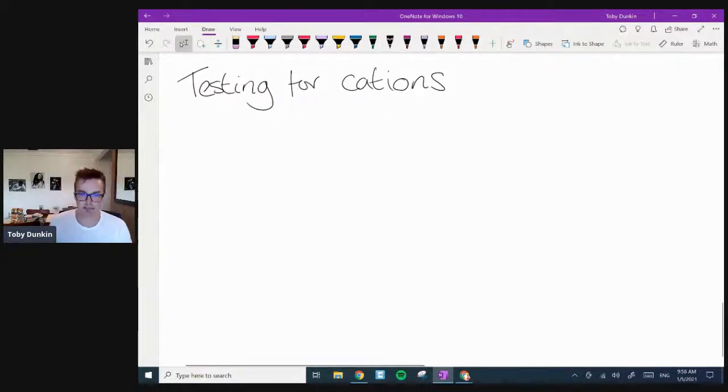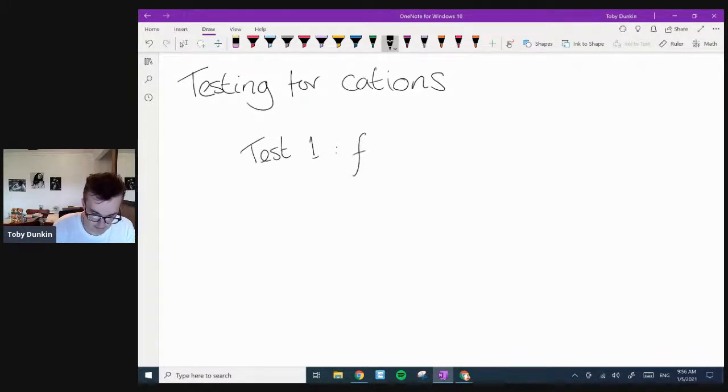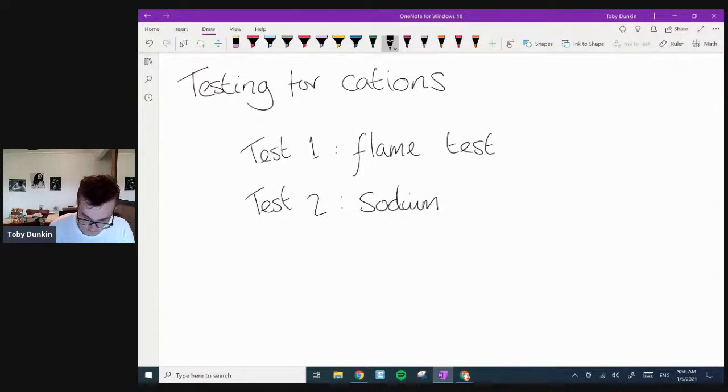Okay, 2 tests. Test number 1 is a flame test. Test number 2 is sodium hydroxide solution. 2 tests, that's it.